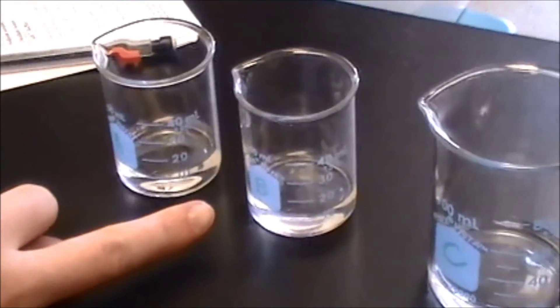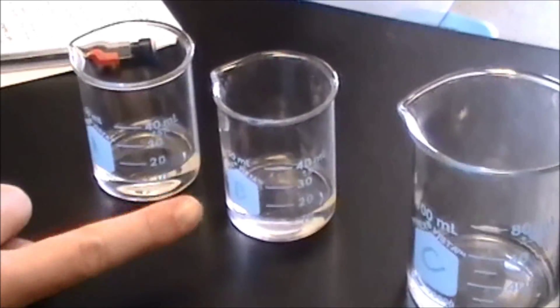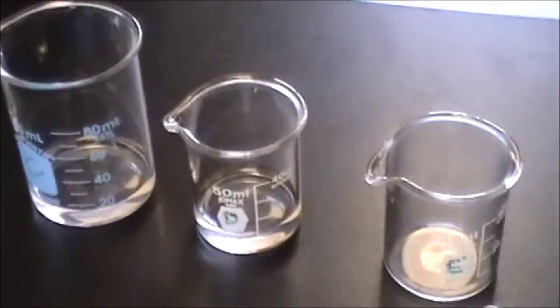So in here, in beaker A, we have 10 milliliters of distilled water. In beaker B, we have 6.7 milliliters of acetic acid and then 3.3 milliliters of sodium acetate. And then the rest of them, the ratios change.